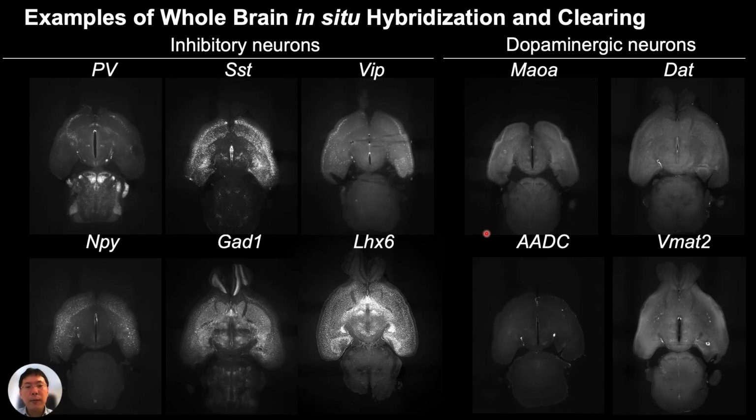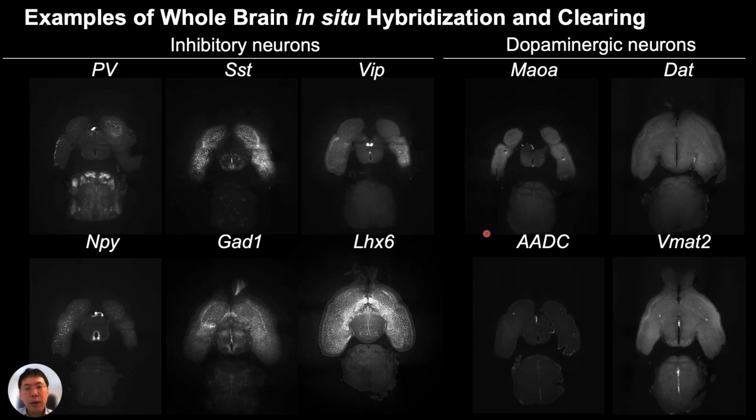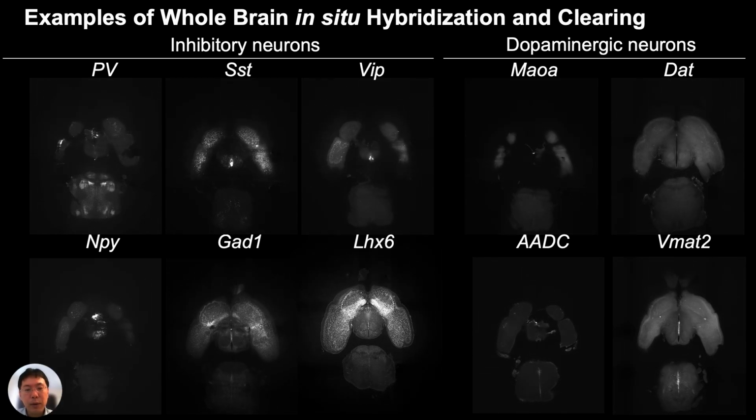So far, we validated more than 30 target probes using our custom probe design script.